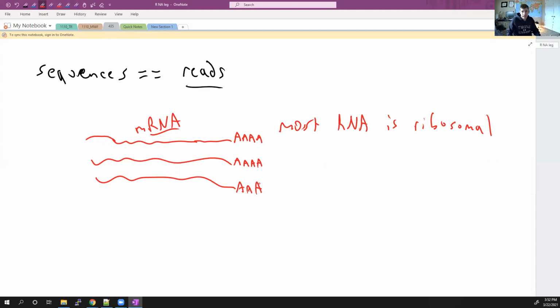If you just look at it wrong, it's going to fall apart on you, degrade and be totally useless. I have certainly taken the same sample, extracted it twice, and one looks great and one looks like absolute garbage, and it was the same extraction. It's tricky to play with.